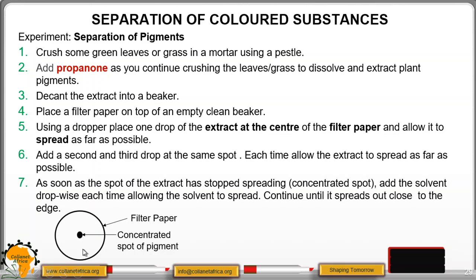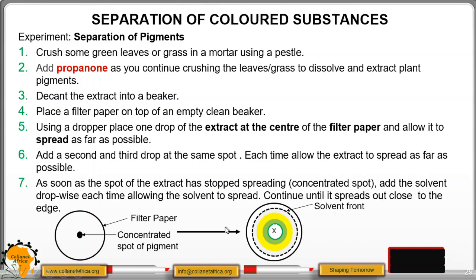We have the filter paper here. We place it on a clean, empty beaker. Then you put a concentrated spot of the pigment. Then you add the moving solvent, which is propanol, and as you do that, it will spread out and form the solvent front.